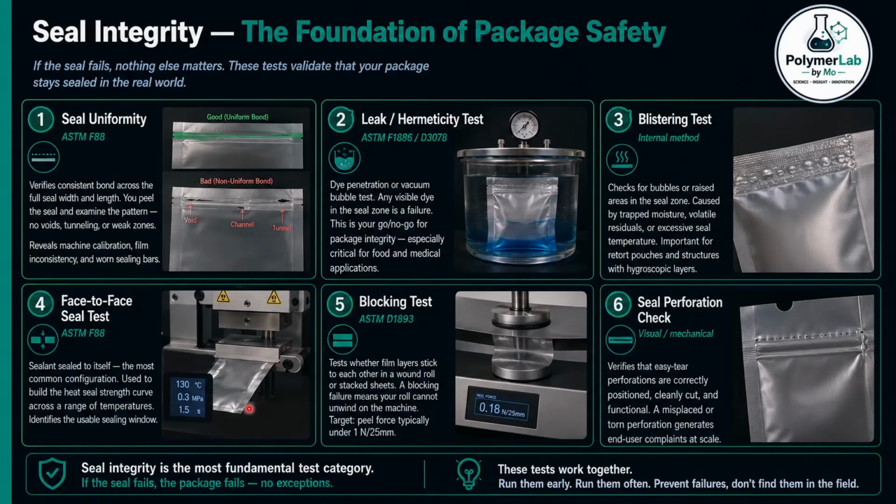Face-to-face seal test. The sealant layer bonding to itself under controlled conditions: temperature, pressure, and dwell time. This is how we build the heat seal window, which we will cover in the next slide.